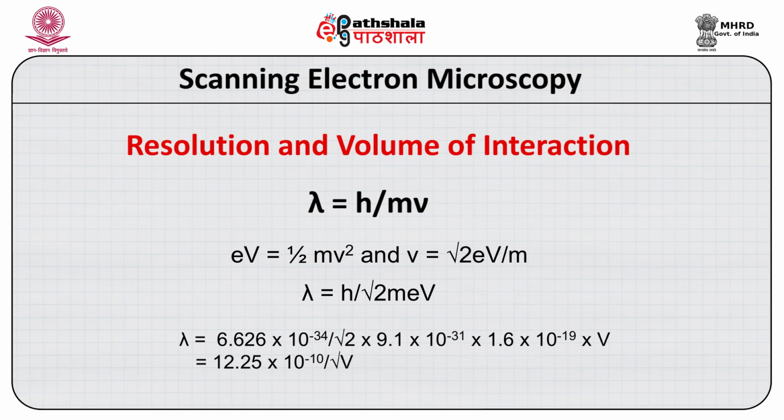However, we must remember that the interaction is not only from an area, but as we learnt earlier, from a depth or from a volume, and the extent of the volume depends on the nature of geological material, that is inversely proportional to the density and directly proportional to the incident electron beam energy, and that defines the resolution in terms of volume, not in terms of area.